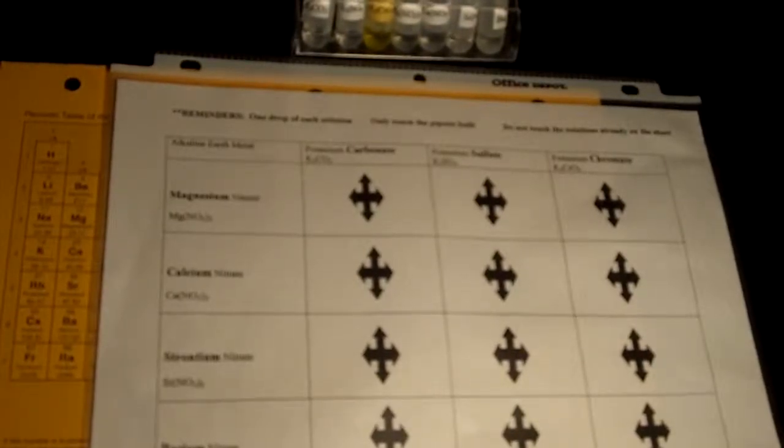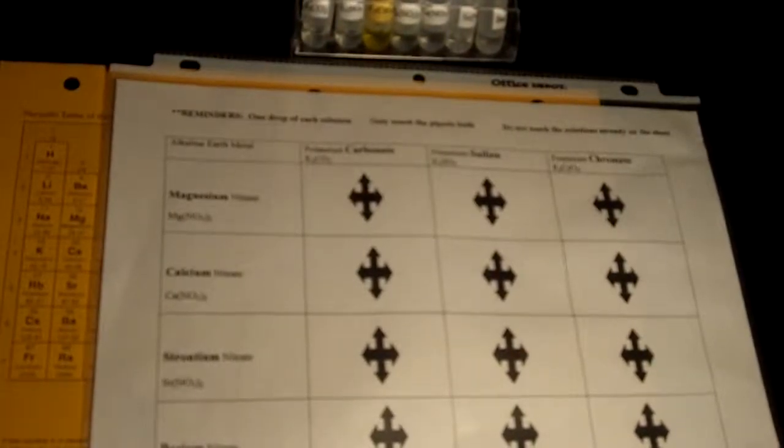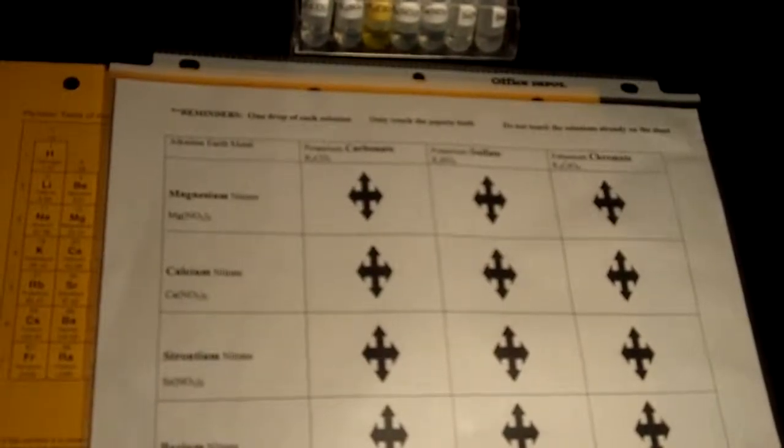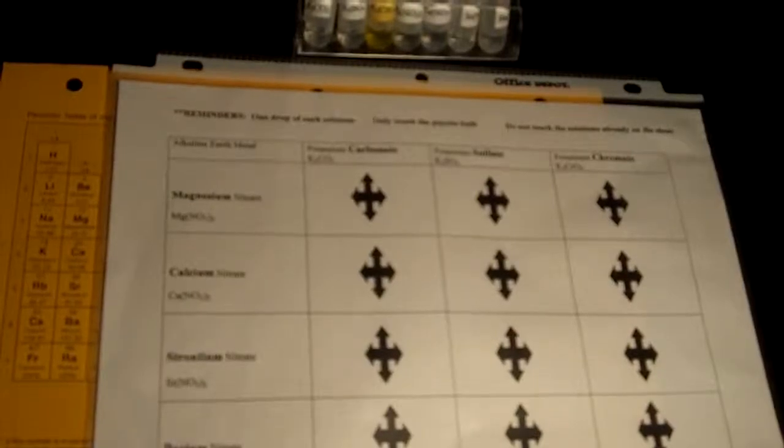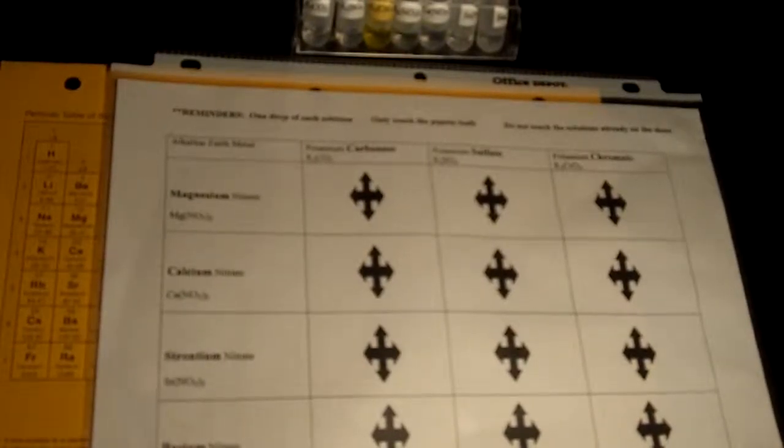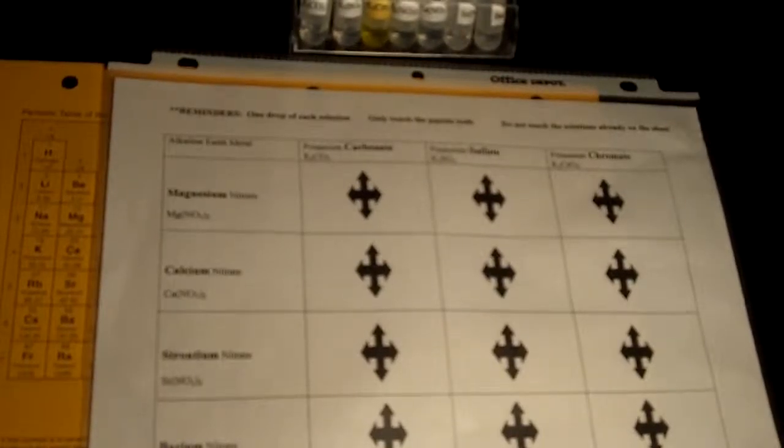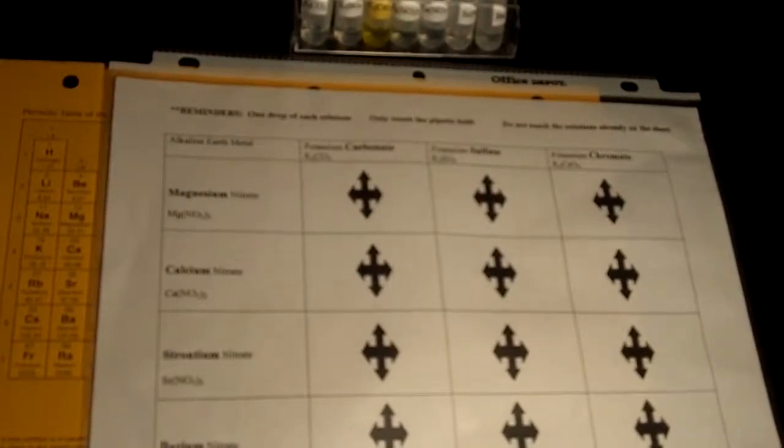One of these properties is the ability to form a precipitate, a solid substance, as a result of a chemical reaction. The precipitate cannot dissolve in water and eventually settles to the bottom of the container. In this laboratory activity, you will examine the reactive properties of the alkaline earth metals and make conclusions about the patterns you observe.